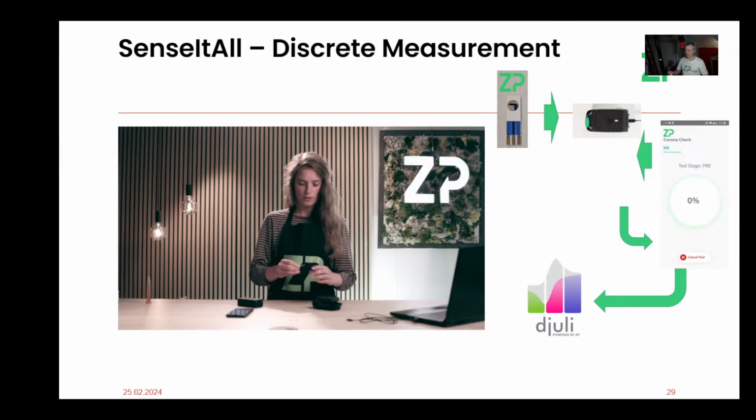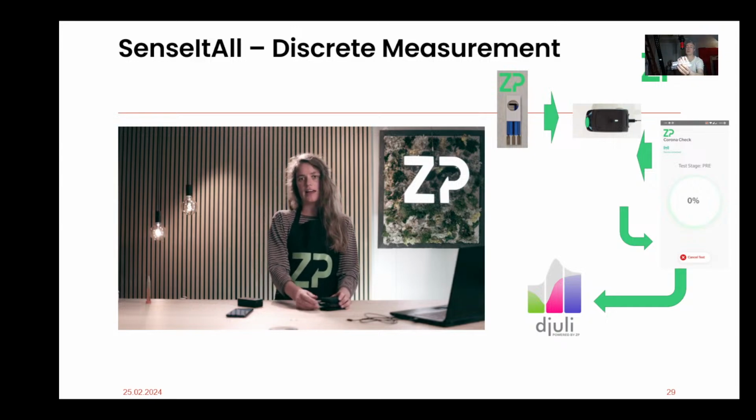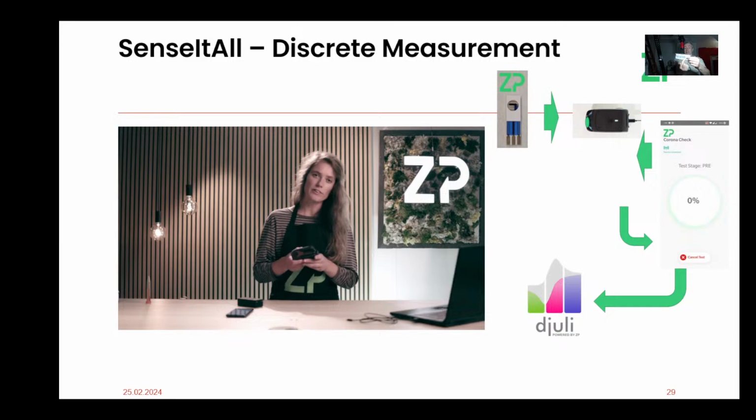In fact, I've got some of the electrodes here now. They can be put into little bags like this. These little bags have a QR code. If they come to the webinar on Tuesday, they'll understand the significance of these QR codes. The screen printed electrodes, all types that they have there, are sort of along here.